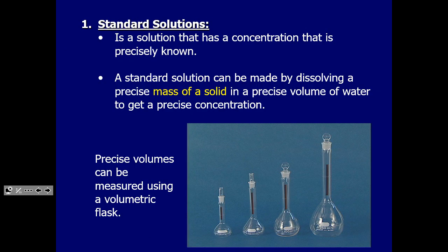Whoops, right there. First, we're going to talk about what a standard solution is.